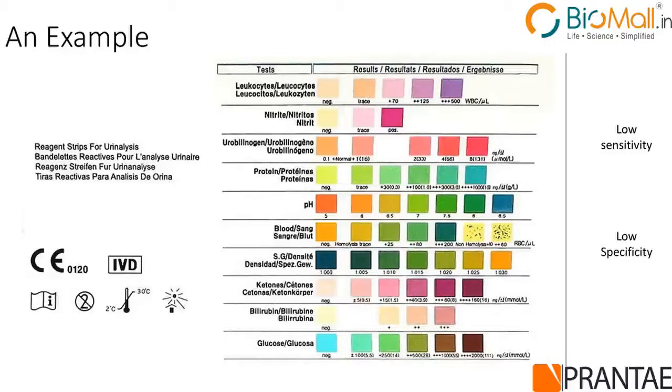However, it is widely known and very well accepted that absorbance based methods have low sensitivity and low specificity. Now, if somebody can remind me at the end of the talk, we can go back to why we say that it has low sensitivity and specificity.